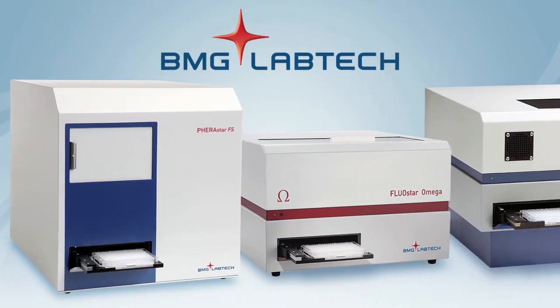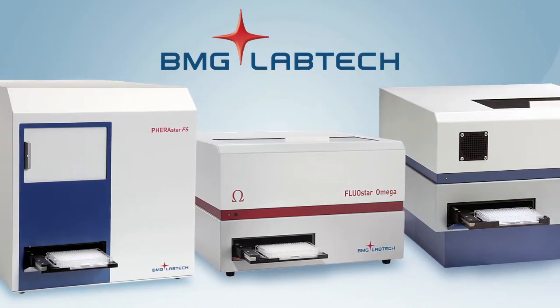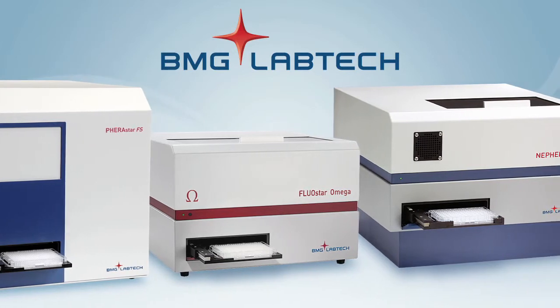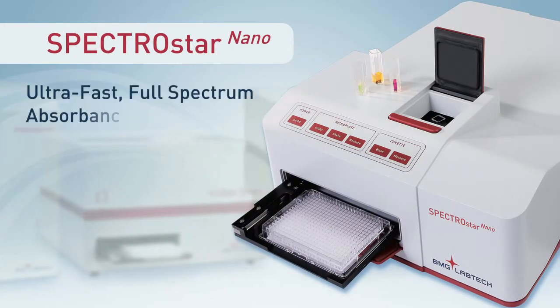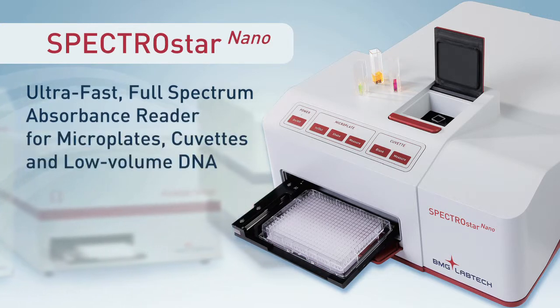For over 20 years, BMG LabTech, the microplate reader company, has provided high-quality microplate readers to labs around the world, and we've brought that experience to the SpectroStar Nano, the best absorbance reader available.